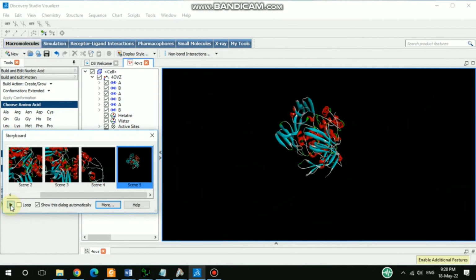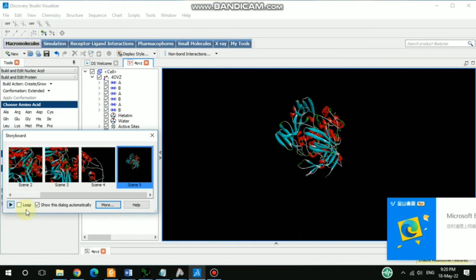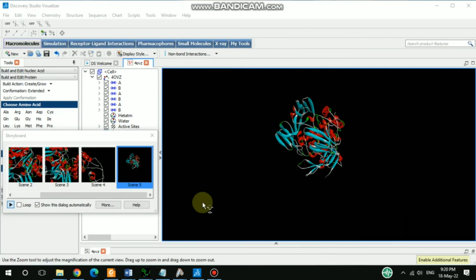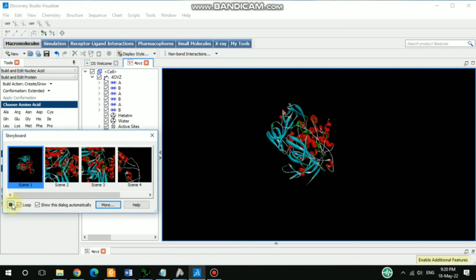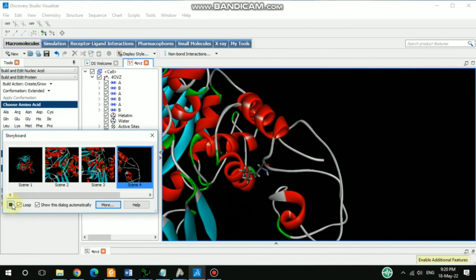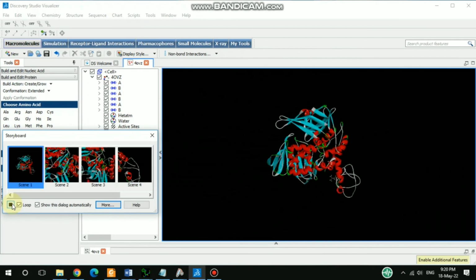If you click this play button, then you can see it will make a movie. Alright, and then if you click this one, the loop option, if you check this one, then this movie will play continuously, non-stop. It's exciting, right?